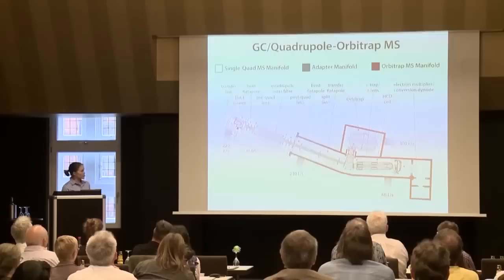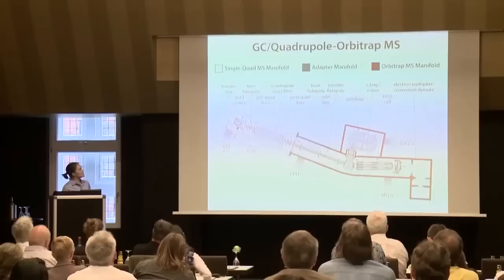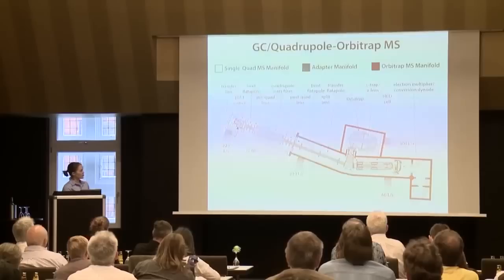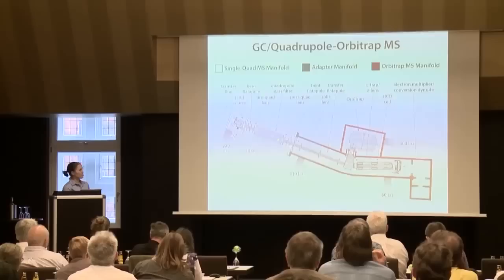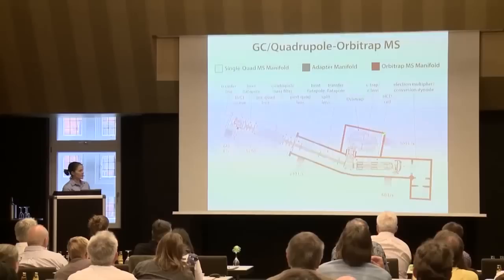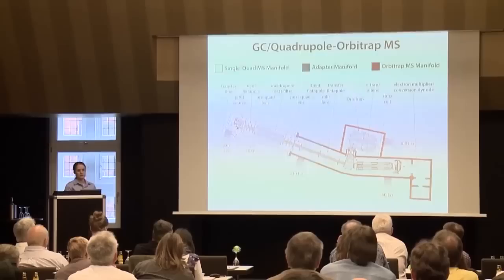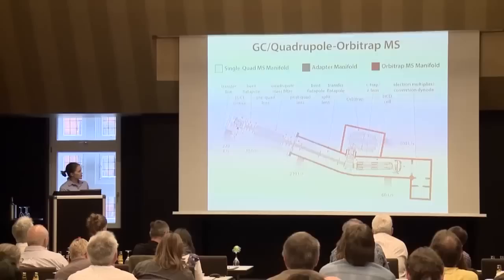This is the GC quadrupole orbitrap MS that we built and now resides in Joshua Kuhn's laboratory in Wisconsin. Here you see the entrance from the GC, an electron ionization or chemical ionization source. Ions then travel down this path through a resolving quadrupole for mass selection, and then further to the C-trap, where they are trapped and then injected into the mass spectrometer. We also have a collision cell for doing beam-type CID.